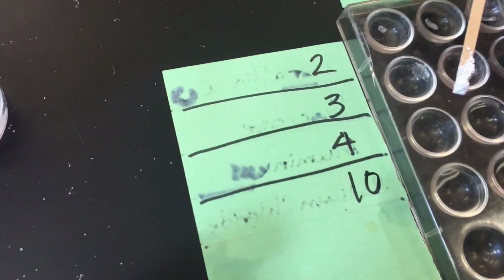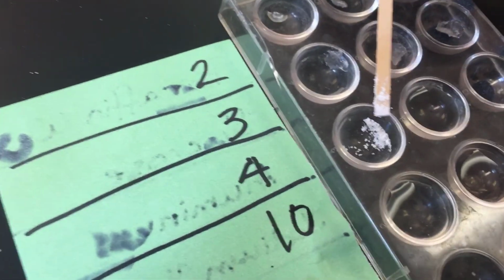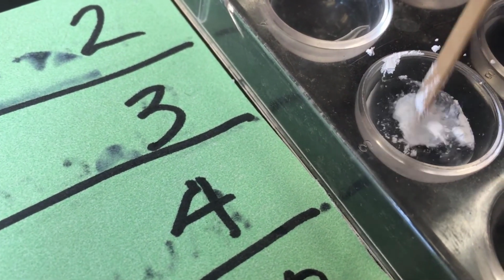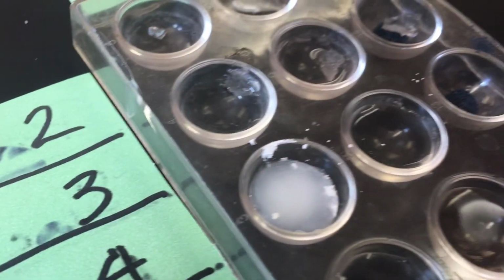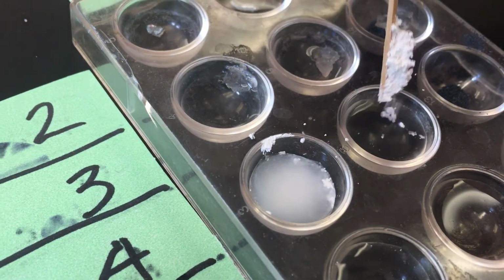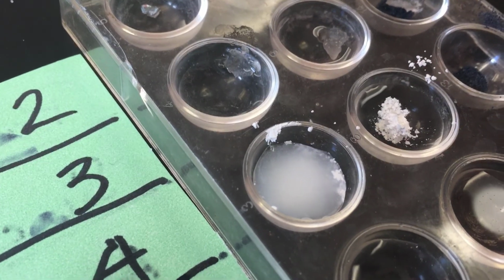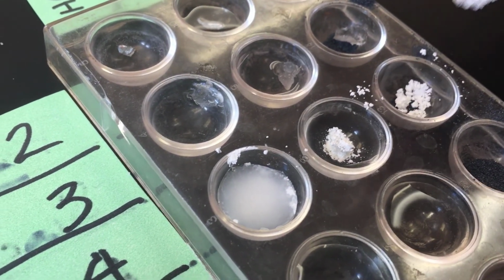Here's sample 4 in HCl. And that does seem to be tiny bubbles. Okay, and here's in sodium hydroxide. Definitely not the same as it was in the acid. And here it is in the magnesium.